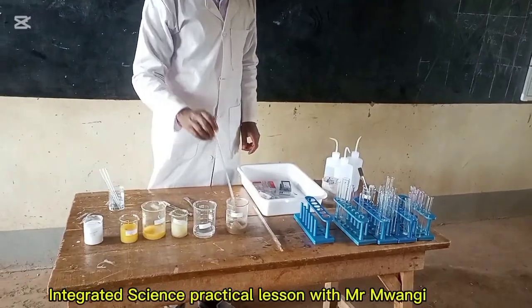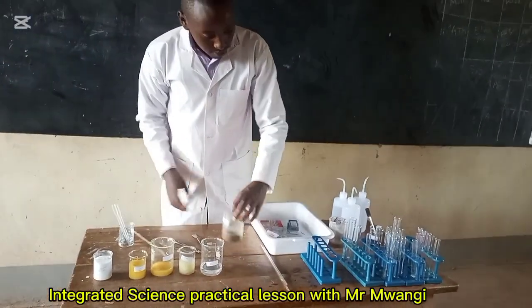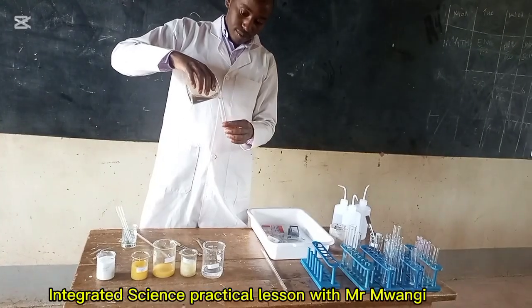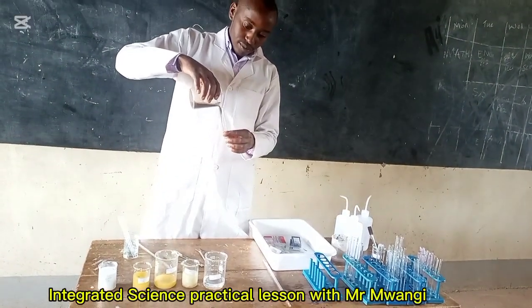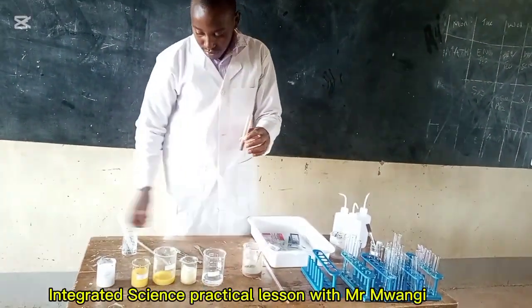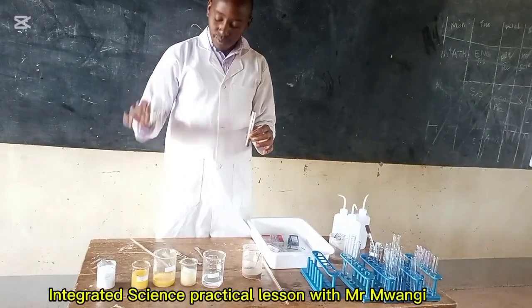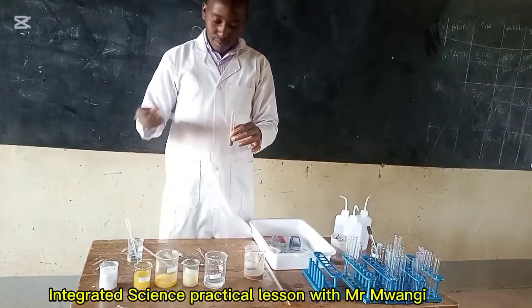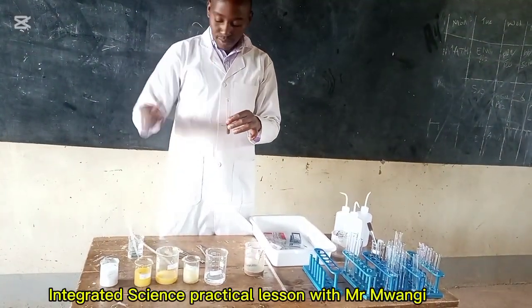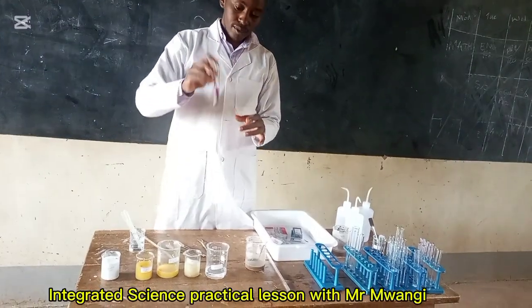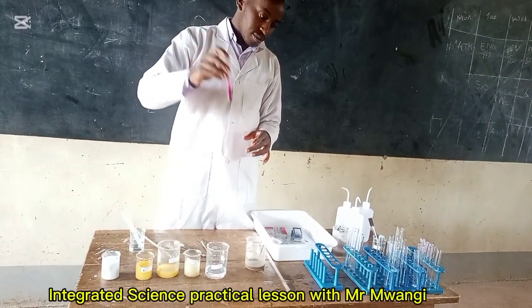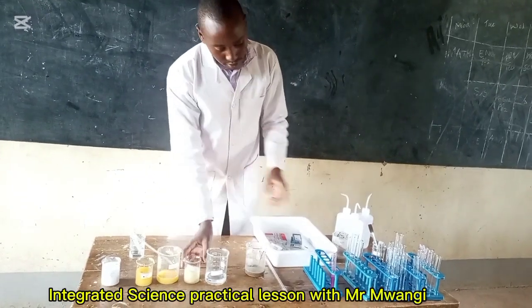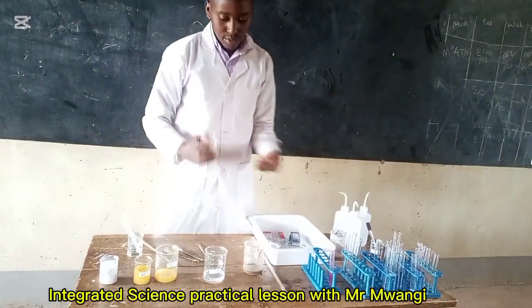I'll pick a test tube and add a little of solution A, then add a few drops of phenolphthalein indicator — which is colorless — using a dropper, and shake a little bit. You'll notice that the color will change to pink, meaning that is a basic solution. That is solution A.